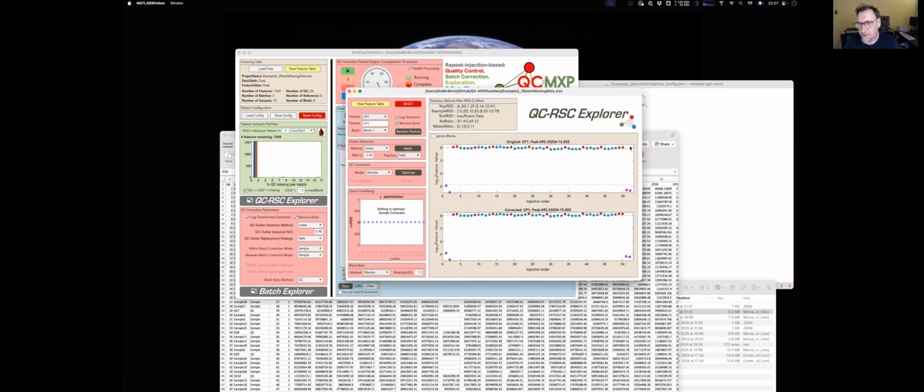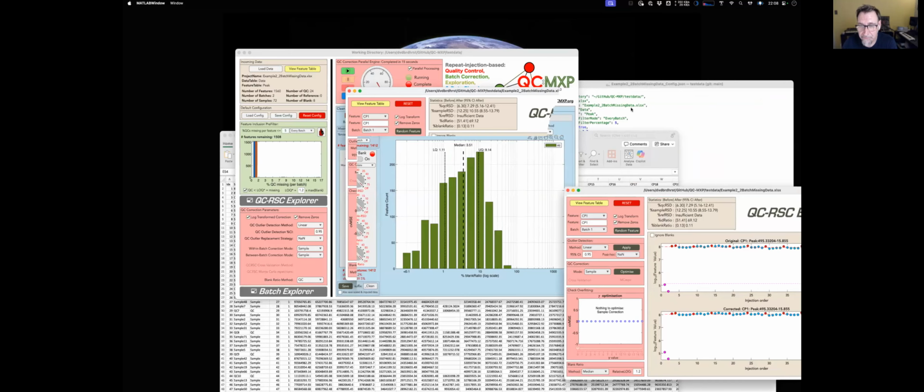So it's basically the ratio of either the median of everything or the QC. Let's just focus on the QC. So it's the ratio of this peak area to this peak area. The idea is that you would want, ideally, or from the paper, we suggested that you want this to be 10 times lower than this. And then you would say that that's a good peak because the signal is a long way away from the blank. Personally, I'm more of a fan of a different approach.